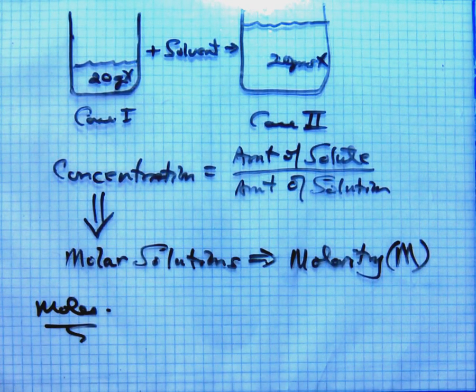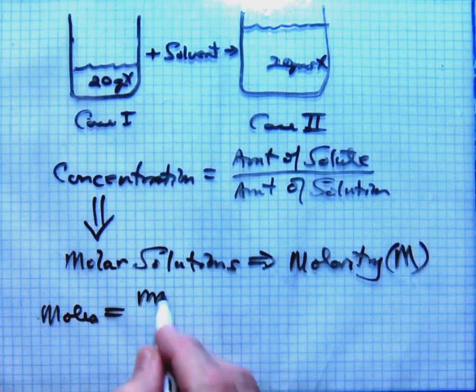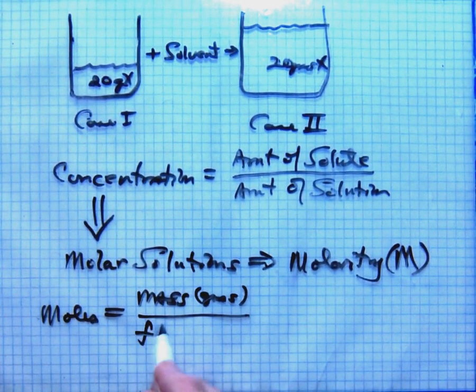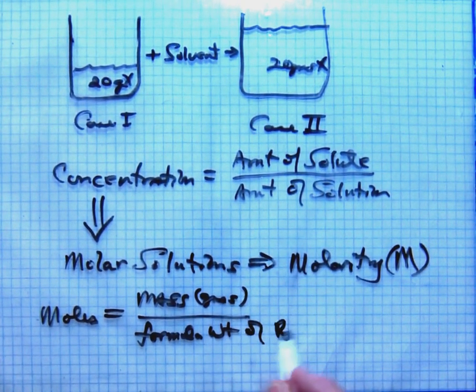In solution preparations, it is moles that we dissolve into the solvent. A mole is equal to a mass in grams of the reagent divided by the formula weight of reagent.